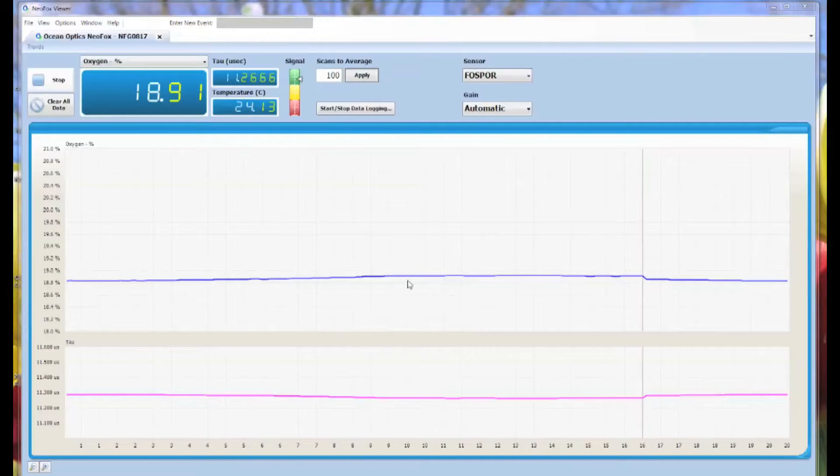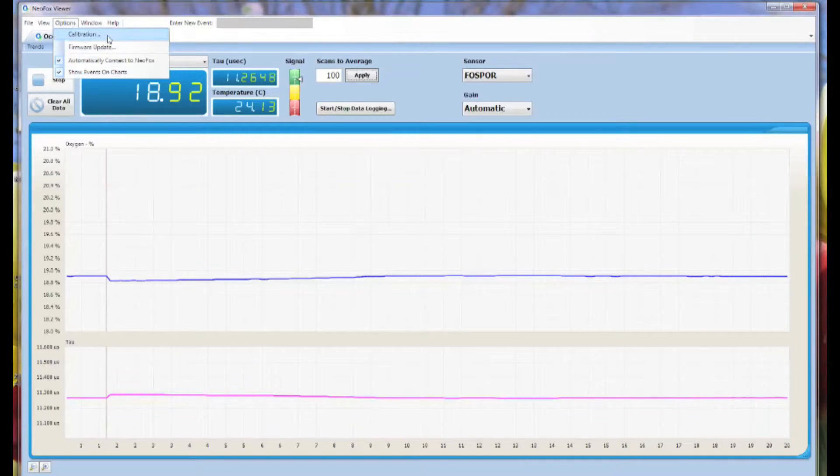To start with a probe kit, you'll open your NeoFox viewer and click on options, calibrations, and a setup box will appear.